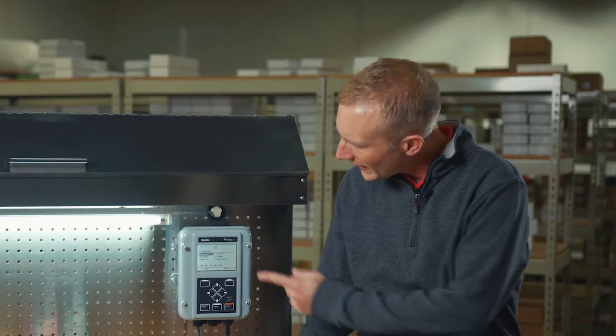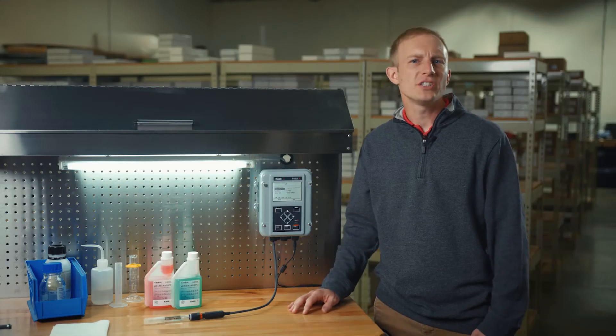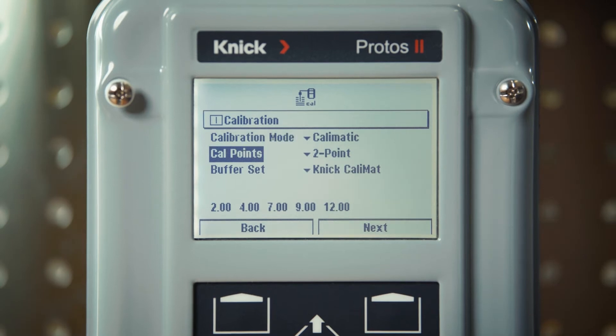Ensure that CALMATIC is selected here before proceeding further. Under the number of calibration points, we will select 2-point and then move on to select the buffer set.